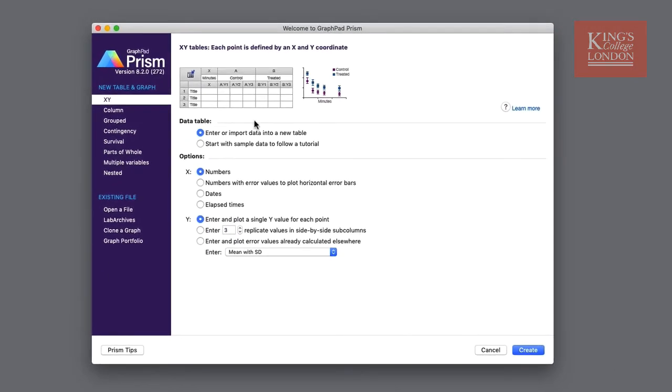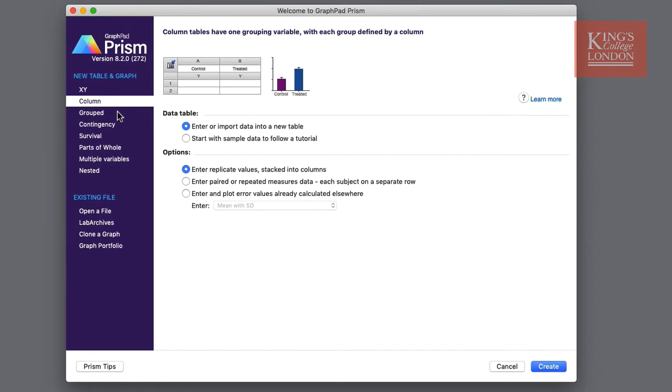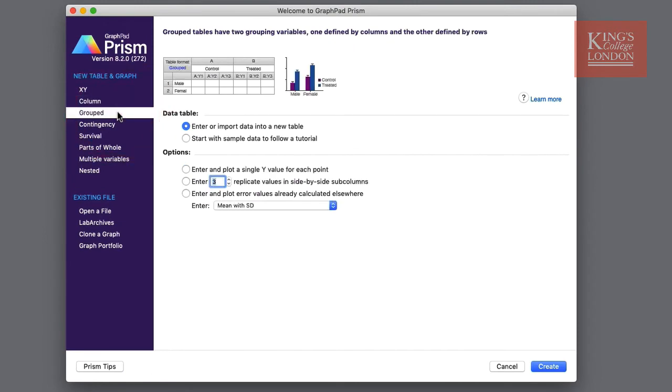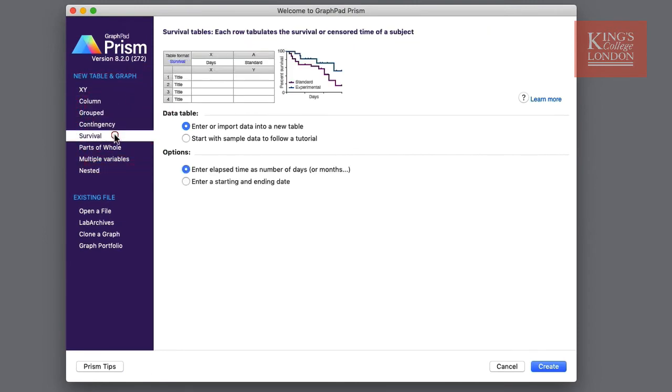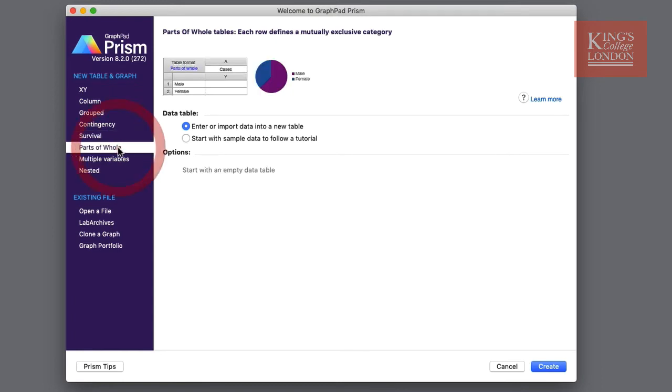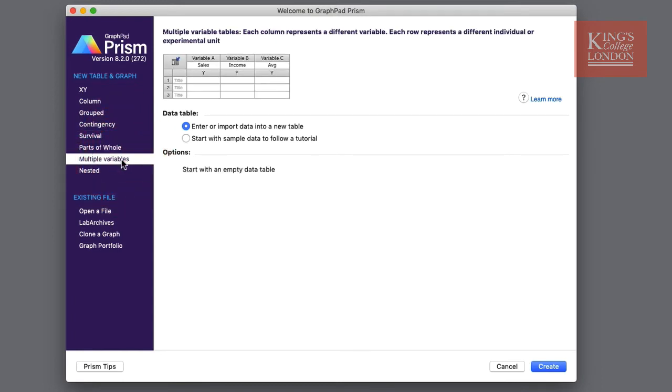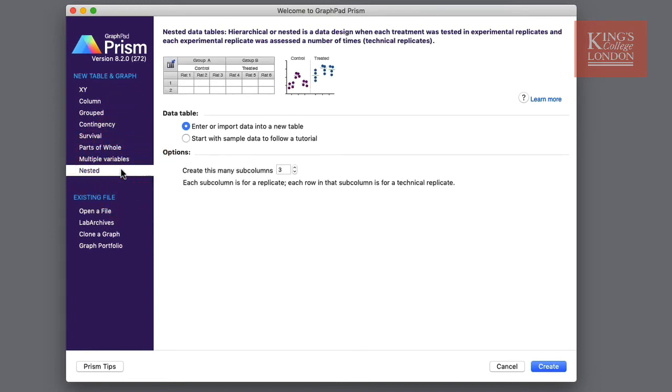Similar choices are listed for Column, Grouped, Contingency, Survival, Parts of Whole, Multiple Variables or Nested Tables.